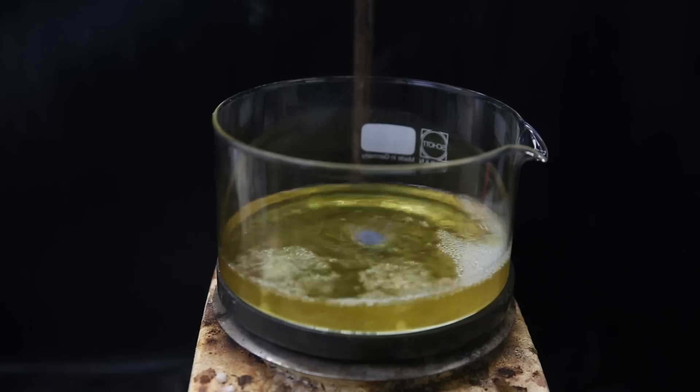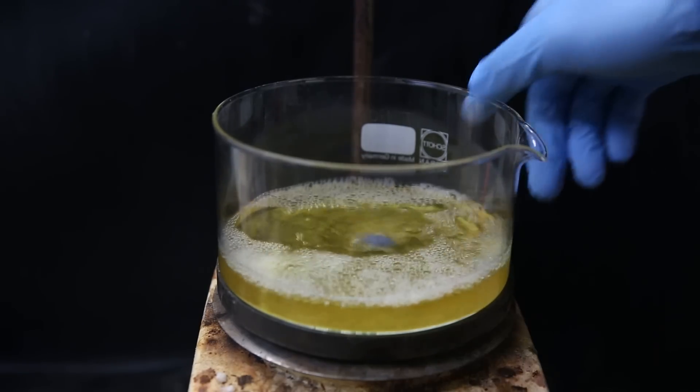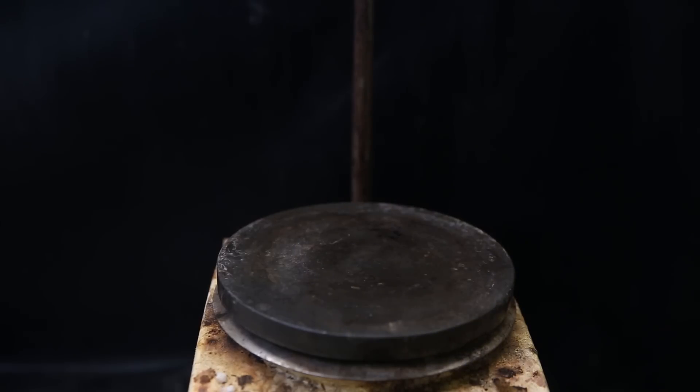A small bit of solid has precipitated out at this point, and I then cover it with a watch glass and set it in the freezer at minus 25C to crystallize out the product.